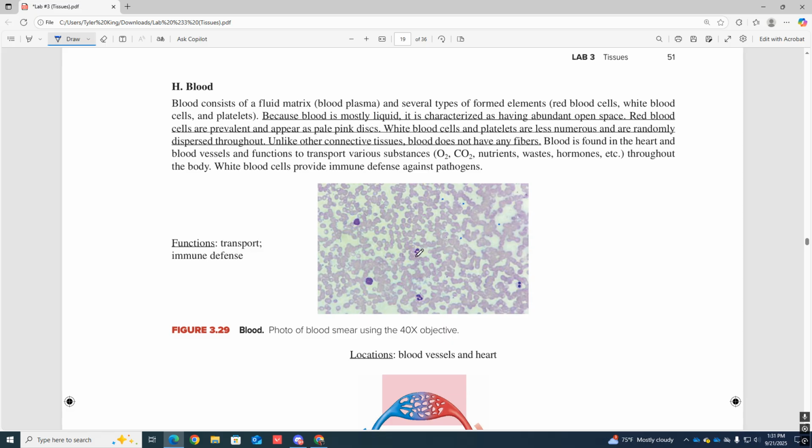And these other guys here, you have these kind of interesting weird structures. These are the white blood cells here, okay? These are the white blood cells. And we'll talk about those more when we get into ANP140, okay?